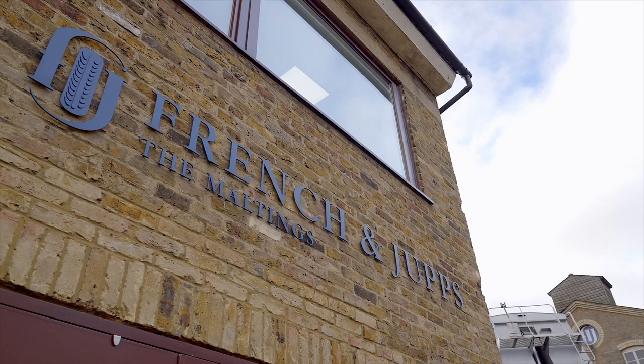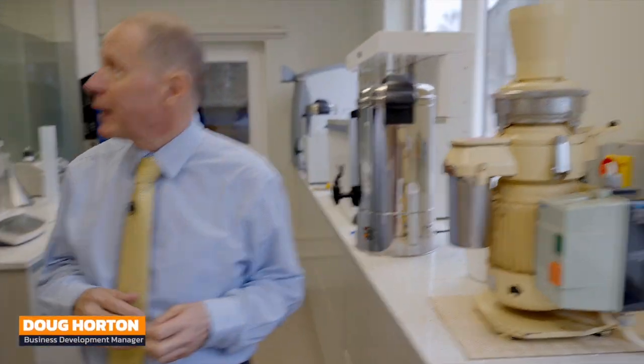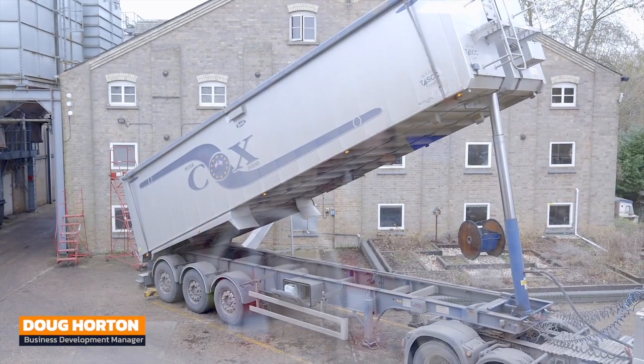Doug, take us through the process when malt arrives here. The barley arrives — we've got a lorry here now tipping. We take a sample and then the sample is brought up to the lab and analysed. We analyse for a range of different things, from nitrogen to VitaScout, which is tested on this machine here.